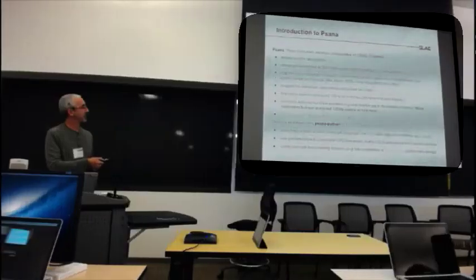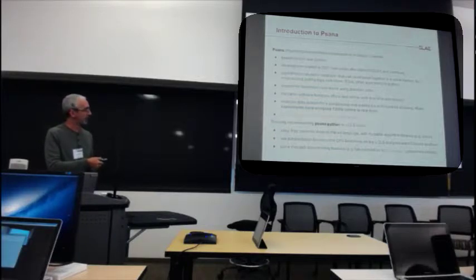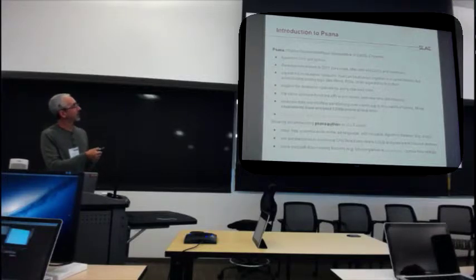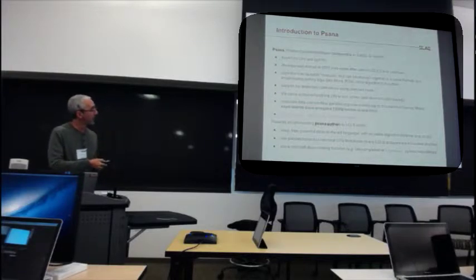A downside of it is it's LCLS specific. You can't go over to Diamond or something like that and run it. It's not specific for crystallography. That's why CCTBX kind of layers itself on top of us. They layer on top of PyAna, but it should be a relatively small change. We're going to do it in a couple weeks, I think. We're scheduled to sit with Nick and we'll change the layering so it's on top of Psana.